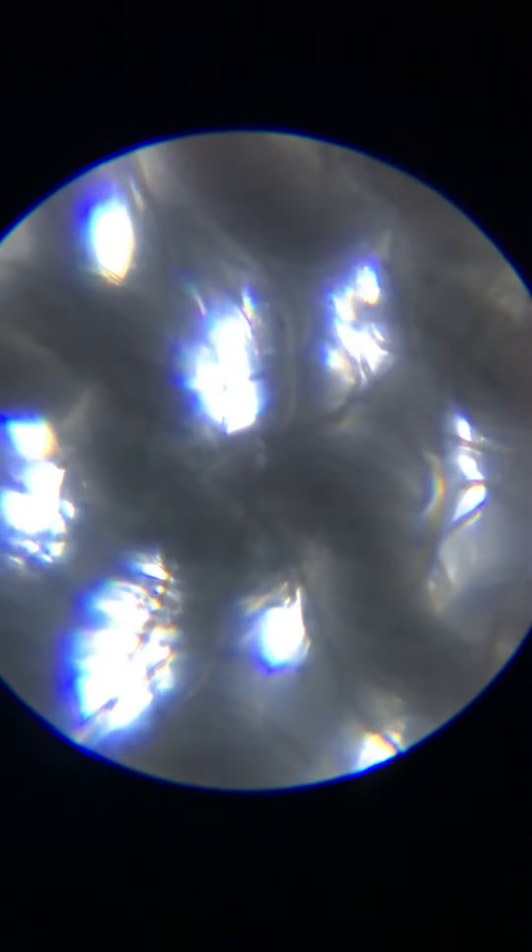This is 640x — or 640, I mean. I just got this microscope and it has a phone mount. I'm not touching my phone right now, guys.